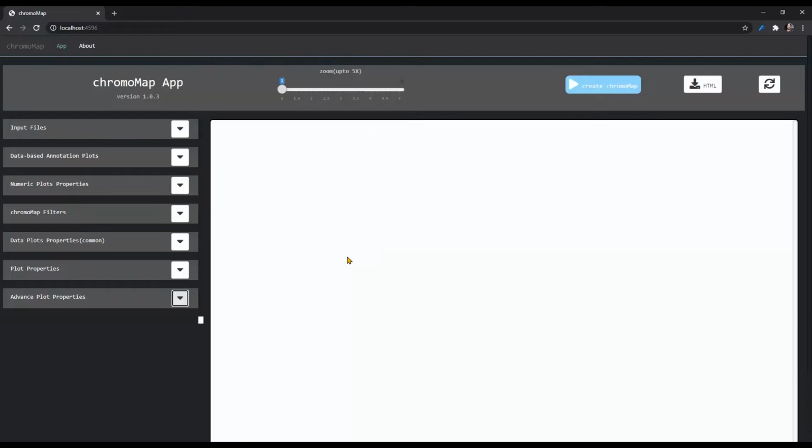It could potentially be a very useful feature in cases where you have to compare different samples or different species, or to represent the homologous chromosomes or something like that. So let's get started.